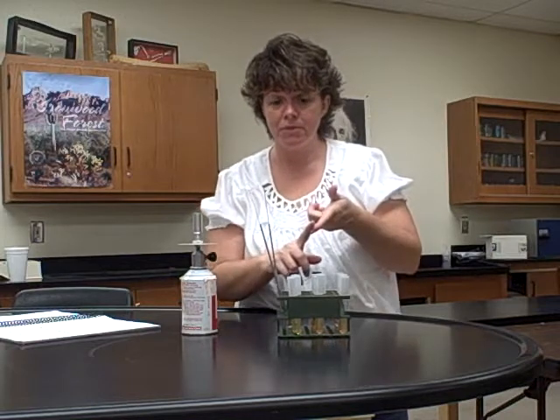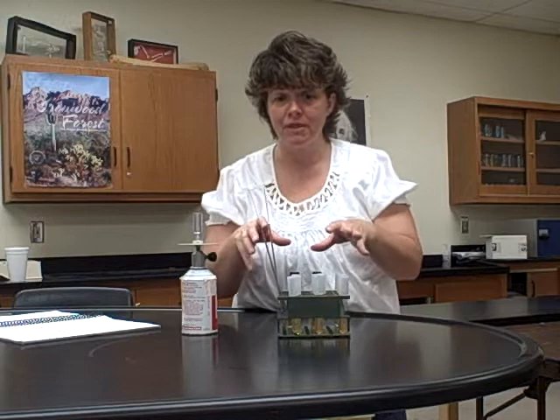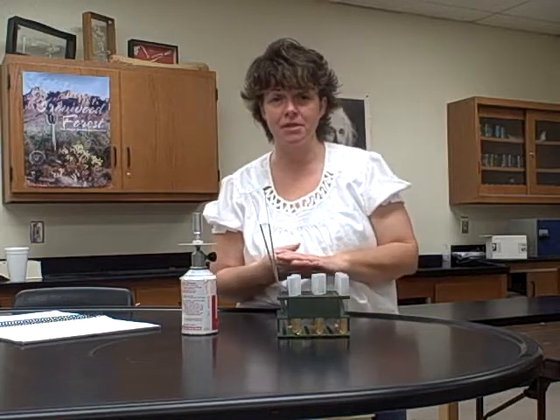So make sure they're labeled. We're going to have to condense racks between different groups so that they'll fit in the incubator, so you may want to identify your group with some sort of a symbol or something so that it doesn't get mixed up with other groups. Okay, that's aseptic technique.